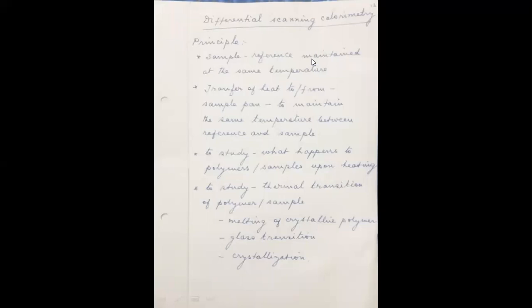The amorphous substances have varying linkages between the molecules. So the weakest one will be broken first, a little bit stronger will be broken next, and then the strongest will be broken last. So you cannot mention any sharp melting point for amorphous substances because they melt over a range of temperature.